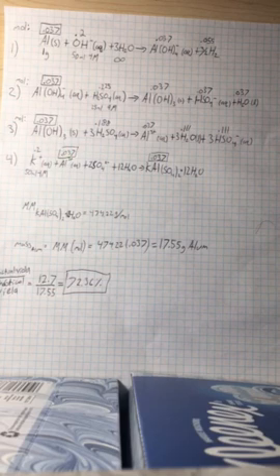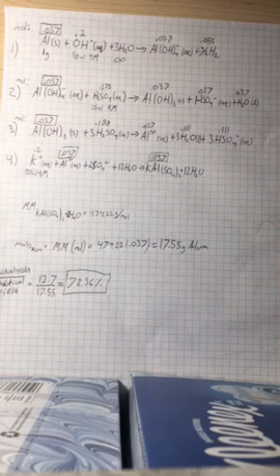The aluminum ions then react with the potassium ions from the KOH that was in the first equation. Again, aluminum ions are the limiting reactant. It also reacts with sulfate ions to yield 0.037 moles of alum. The molar mass of alum is 474.22 grams per mole. When you multiply the molar mass by the moles of alum, we end up with 17.55 grams of alum.